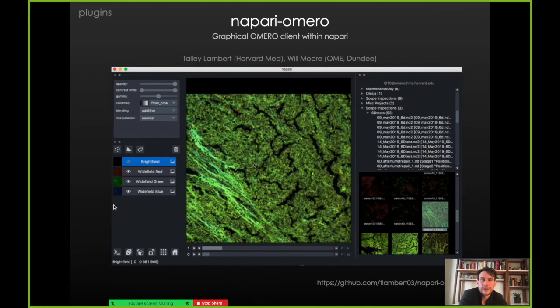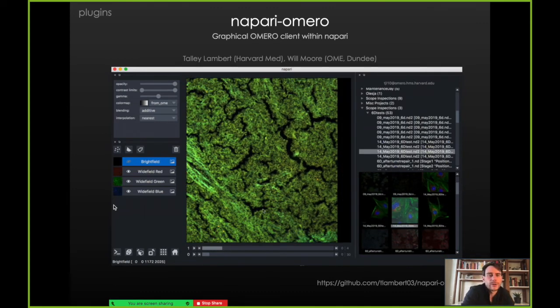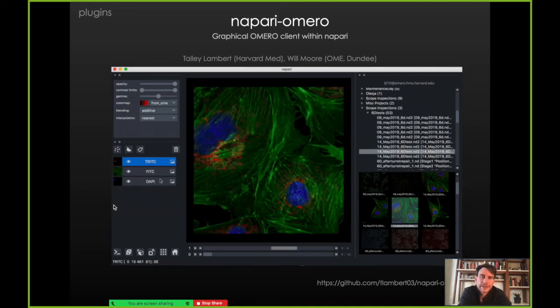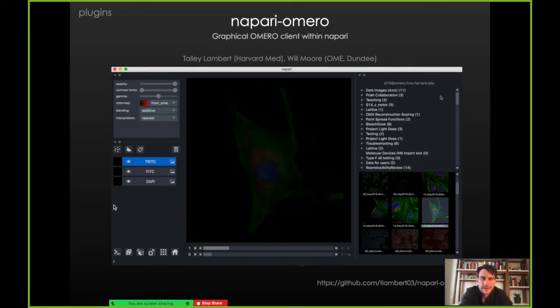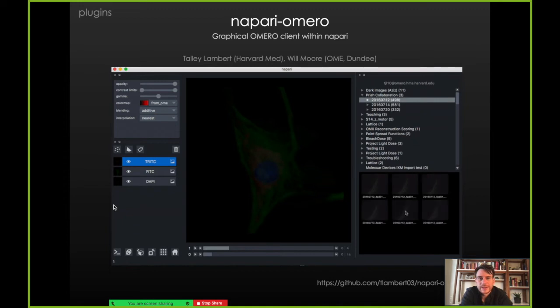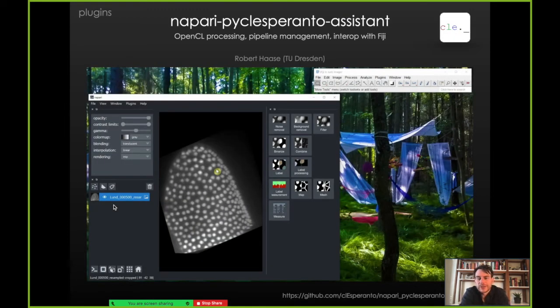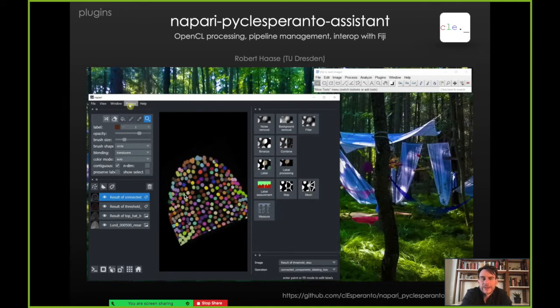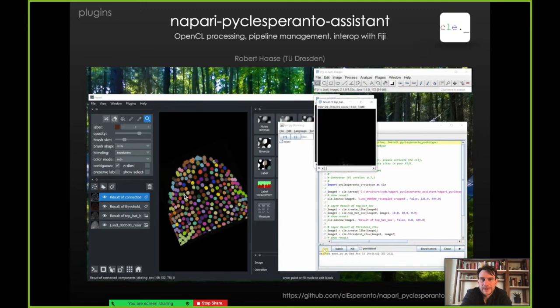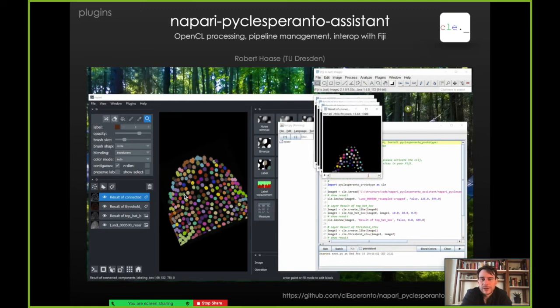We've also got Napari Omero, a graphical Omero client within Napari from Tali Lambert and Will Moore from the OME team — a great example of collaboration between Napari and OME. We really look to collaborate and work well with existing software where possible. Here you're able to browse your Omero instance and view data directly in Napari. There's also a great example of OpenCL processing with Napari PyCL Esperanto Assistant and pipeline management and interoperability with Fiji from Robert Haas in Dresden, allowing you to make a script, run it in Napari, and then immediately also run it in Fiji.